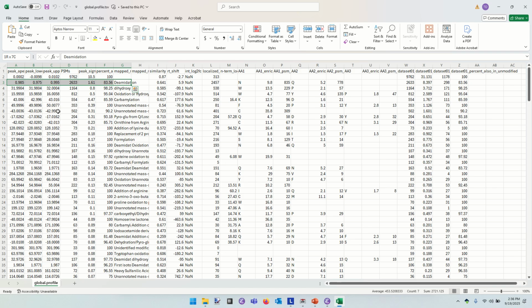Within a peptide, if you have something like an asparagine followed by a glycine, you can end up with some weird chemistry between the side chain of asparagine and the following peptide bond. And one of the things that can happen is that asparagine in solution can turn itself into aspartate. So the difference between asparagine and aspartate is 1 Dalton. Similarly, the difference between glutamine and glutamate is 1 Dalton.